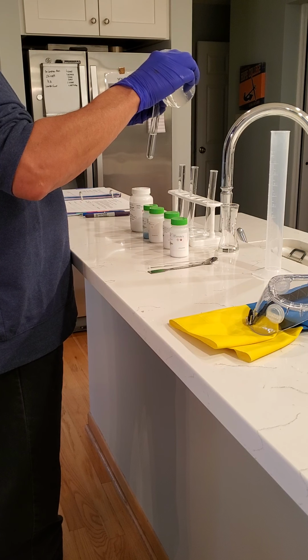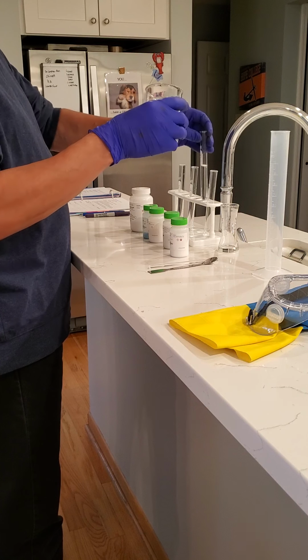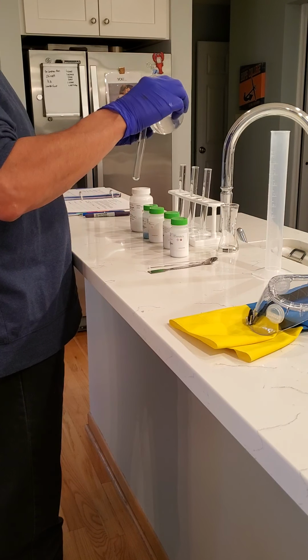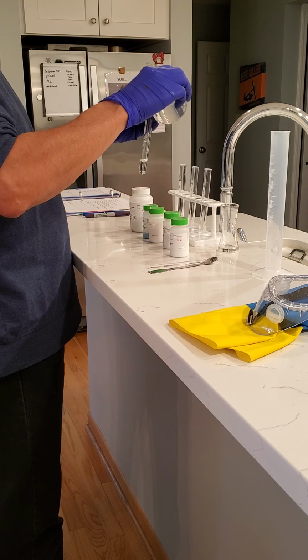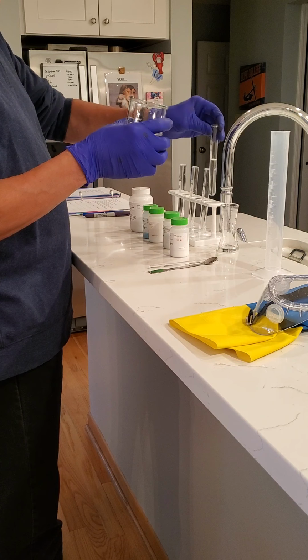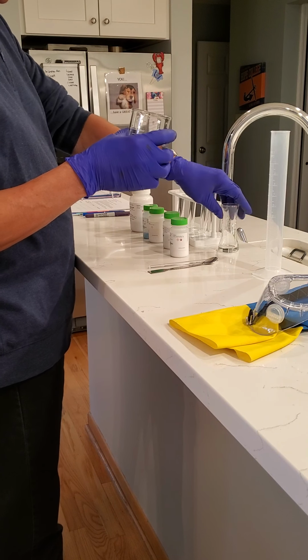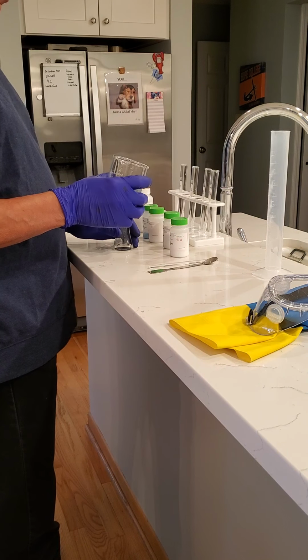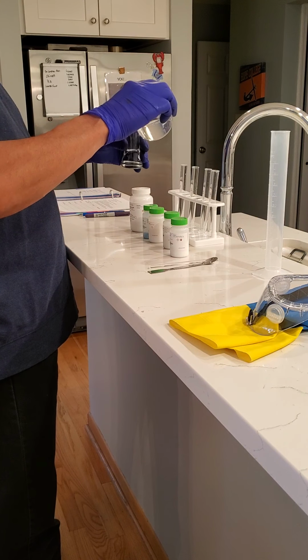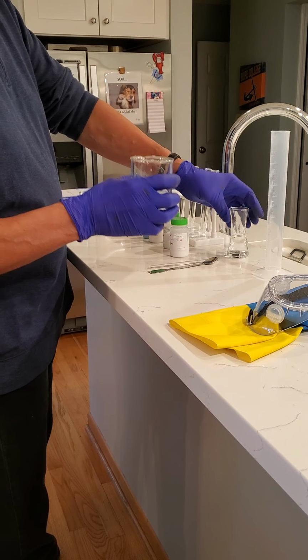And then we're going to add each of the solids to the test tube and shake them to observe solubility. So this part is strictly observation, and you'll make notes in your lab document as to what you saw when you added the solids.